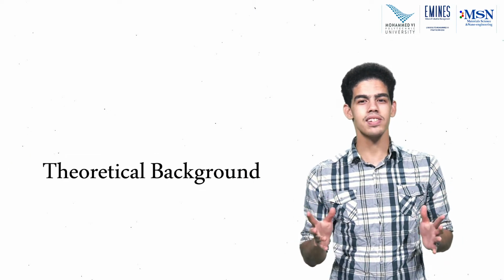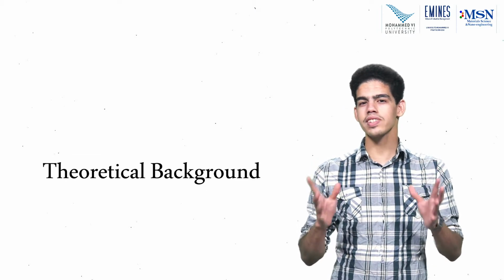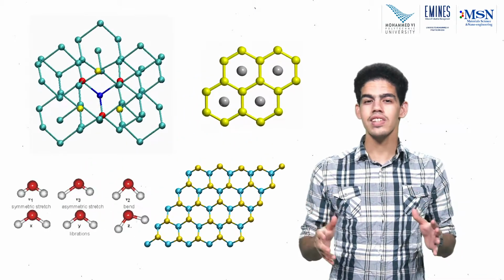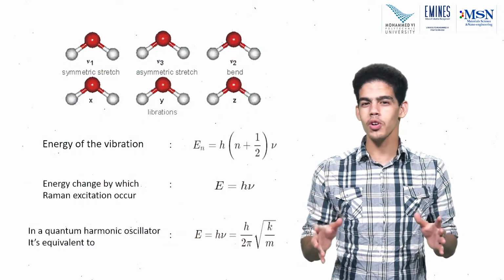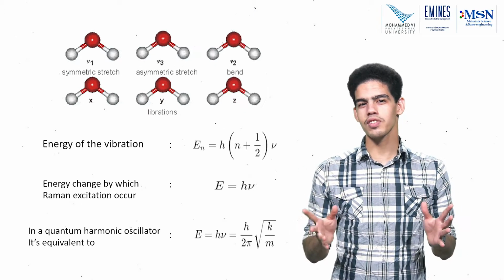I will begin by giving you a general idea about how the Raman spectroscopy method works and how it can help us understand the changes that happen in the structure on the atomic scale and follow these changes during cycling. Inside a crystal, molecules can vibrate with given vibrational frequencies. Each crystal is characterized by its own well-defined vibrational modes, and each mode matches what is called a phonon that can change its energy with a specific value.